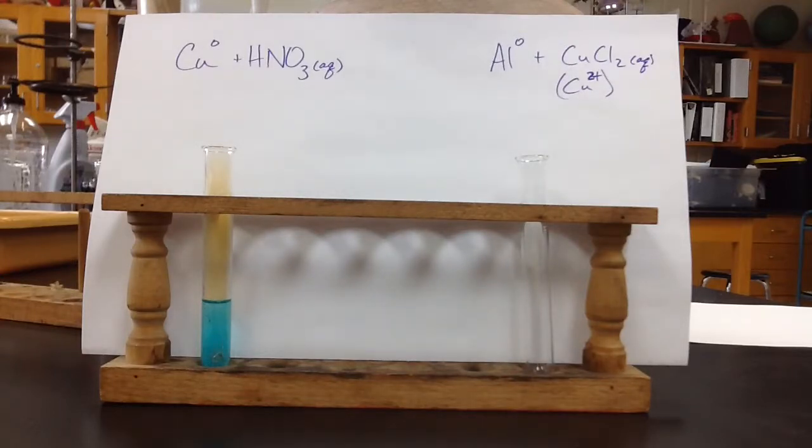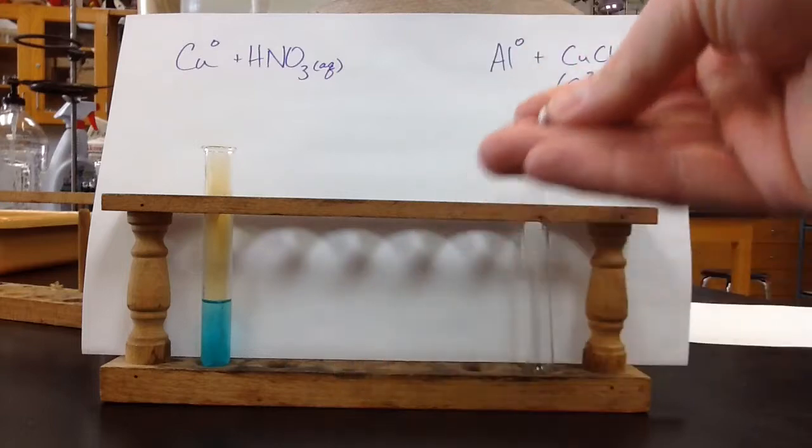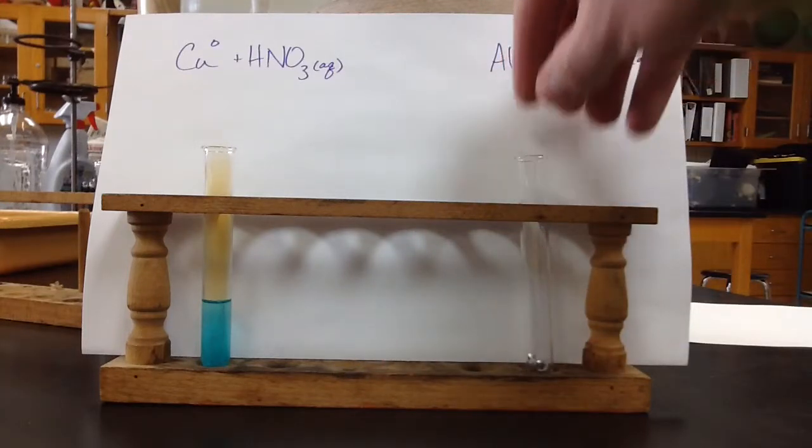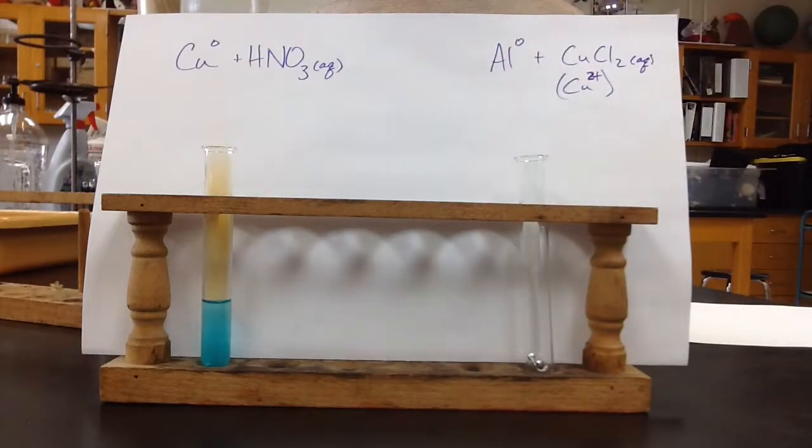While that's happening, we're going to go ahead and start the reaction of aluminum and copper chloride. Here's our piece of aluminum, and we're going to drop that in, and we're going to get our solution of copper chloride. It's a one molar solution, pretty strong as it comes for copper chloride.